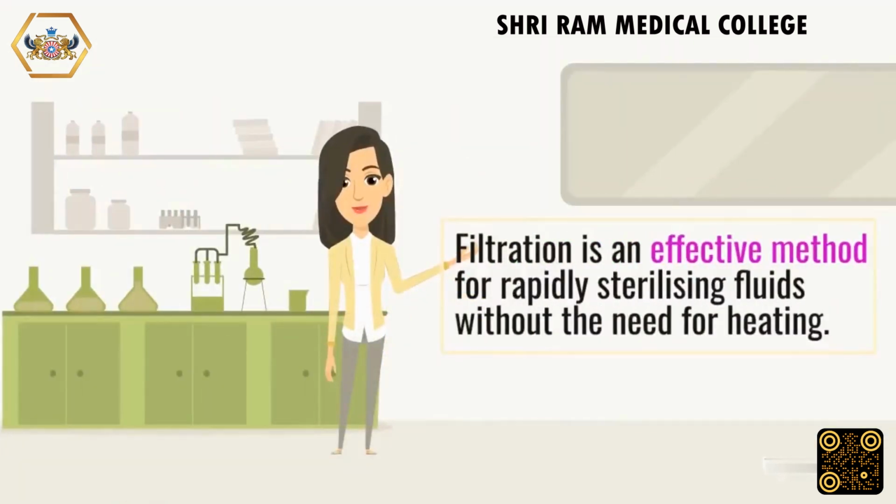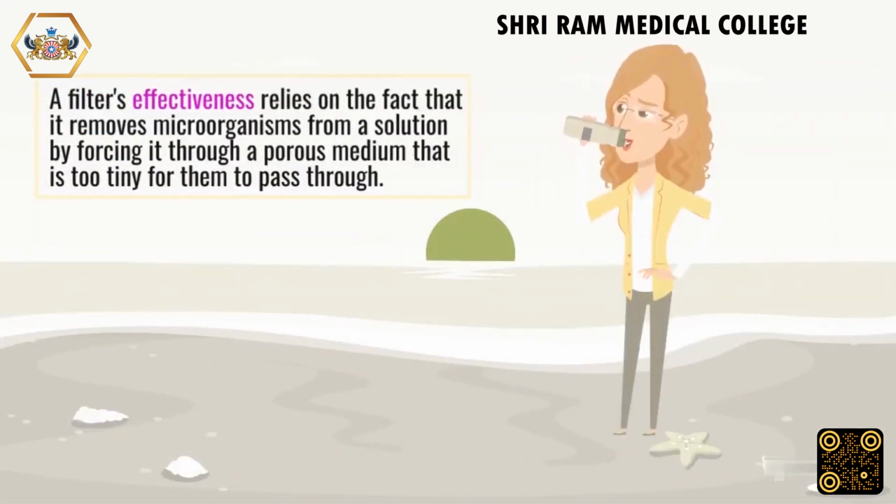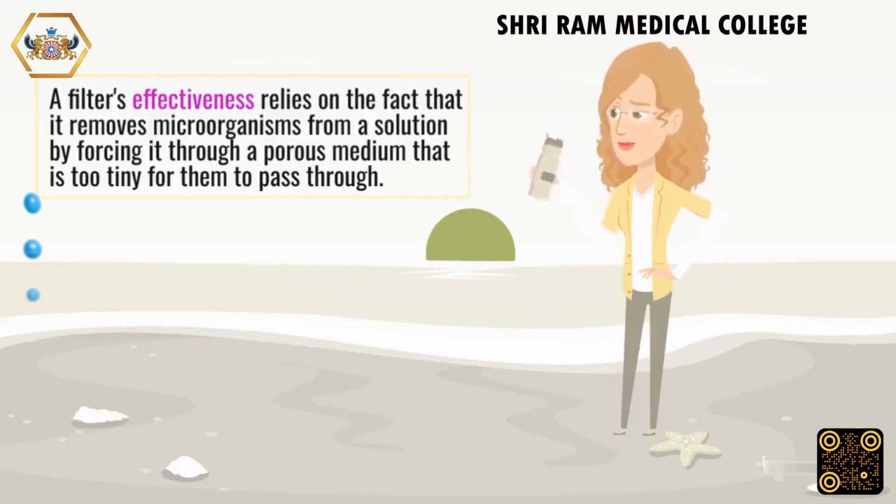Filtration is an effective method for rapidly sterilizing fluids without the need for heating. A filter's effectiveness relies on the fact that it removes microorganisms from a solution by forcing it through a porous medium that is too tiny for them to pass through.